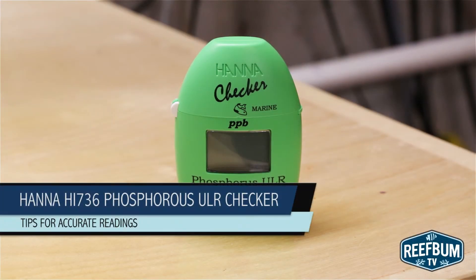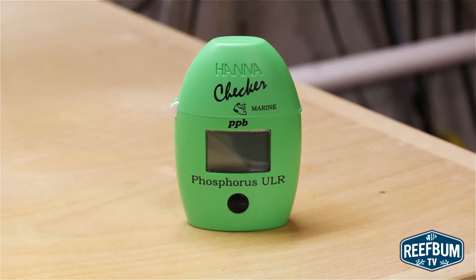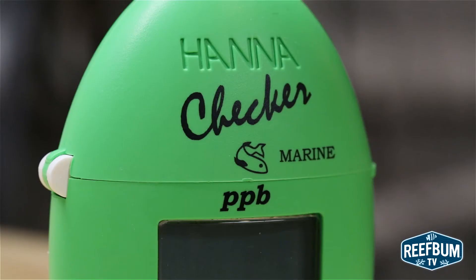This is Keith Berkelhammer and this is ReefBumTV. Recently I've been having issues getting some consistent and accurate readings with my Hanna HI736 Phosphorus Ultra Low Range Checker. Here are some tips to help ensure you get the most accurate readings possible.